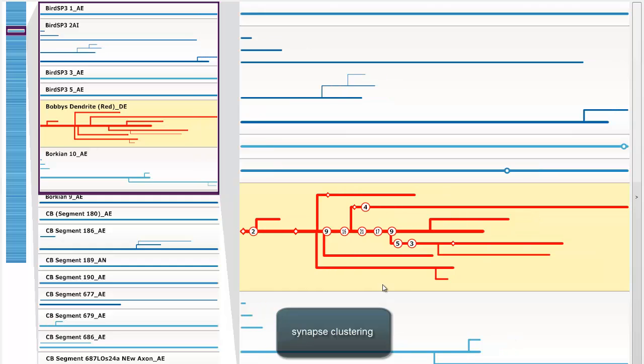Synapse clusters can be fanned out to allow users to inspect their individual synapses. Furthermore, synapses in a cluster always retain their spatial ordering.